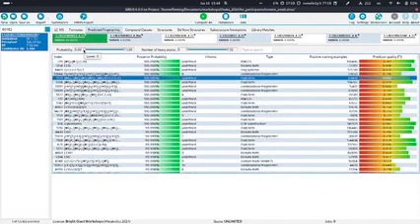Okay, let's just filter this list a little bit and select, for example, only substructures which have a probability of 0.3.